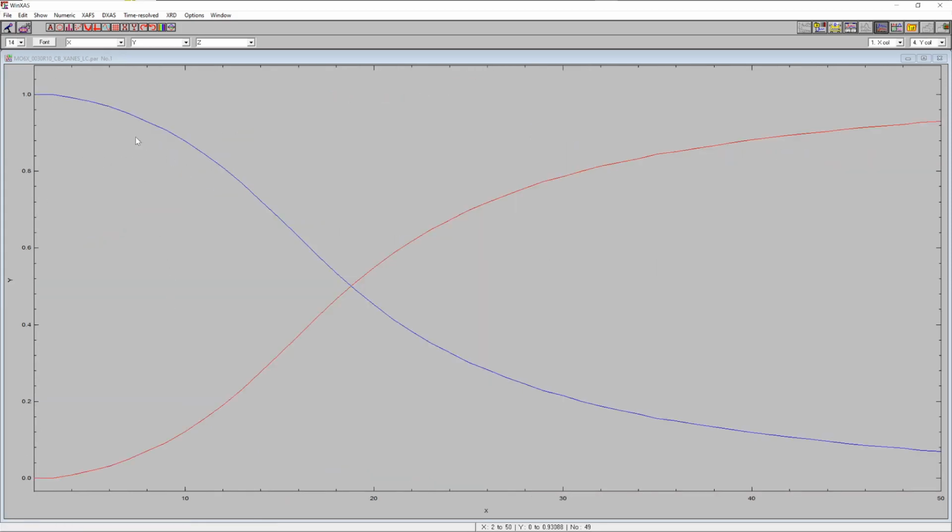So again, blue trace now is the concentration of the molybdenum trioxide. We start with molybdenum trioxide. We observe the reduction of molybdenum trioxide to the dioxide and the formation of molybdenum dioxide. And apparently this does not go to 100%. So at the end of this run, we do not see complete reduction here. The rate slows down. It starts fast, but then apparently there's a change in the rate limiting step here.